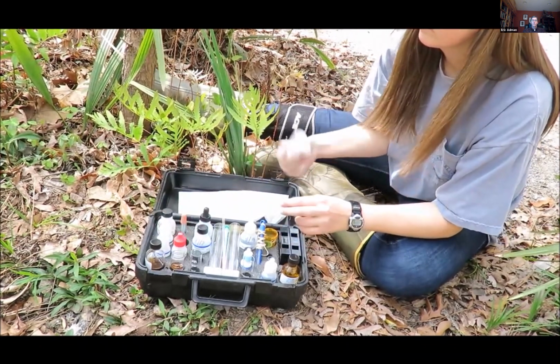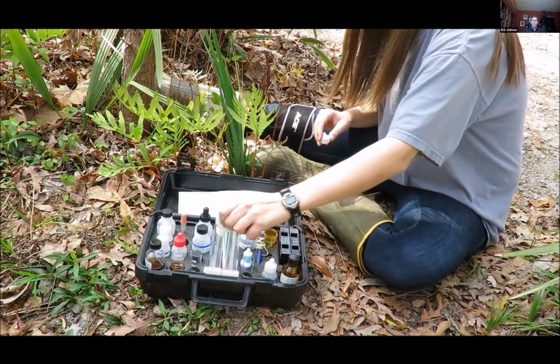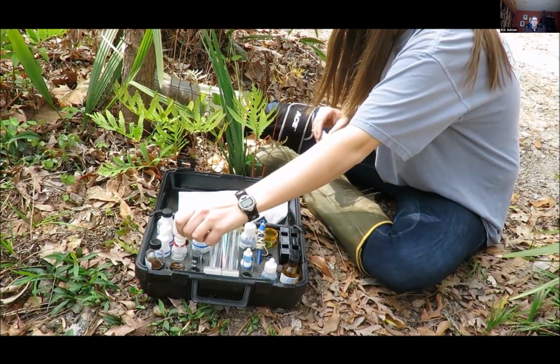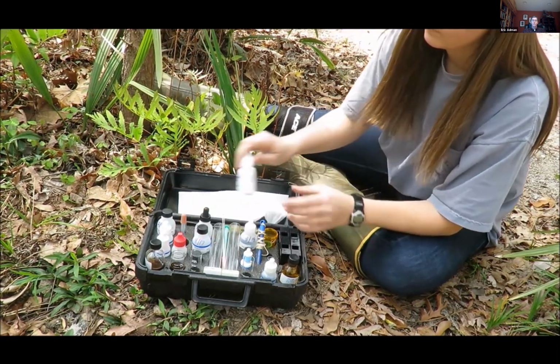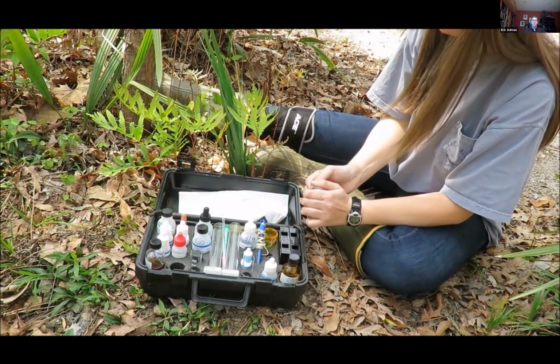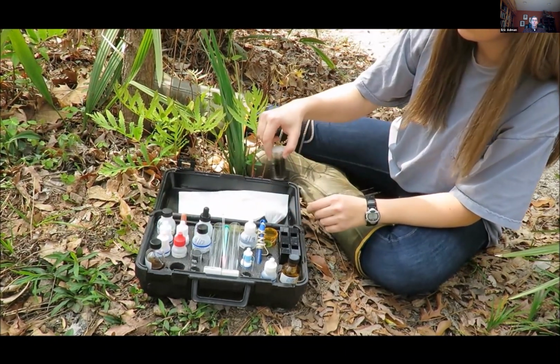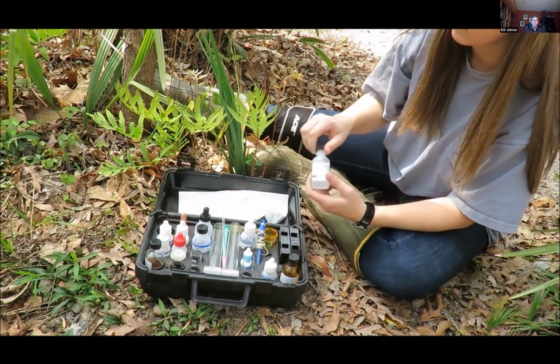Locate the starch indicator in your kit. Add 8 drops to the tube and gently swirl to mix. The sample should turn dark blue to black. Cap the titration tube with the corresponding cap. It should have a hole in the center.